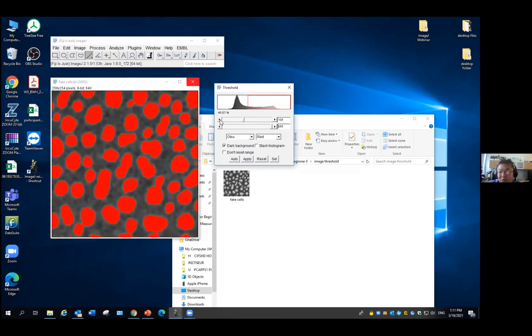If I set this to 100, as we just did, now everything shows up red here. These are pixels whose intensity is bigger than or equal to 100. Every pixel showing its original grayscale has an intensity value lower than 100.